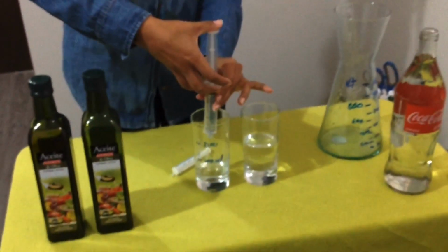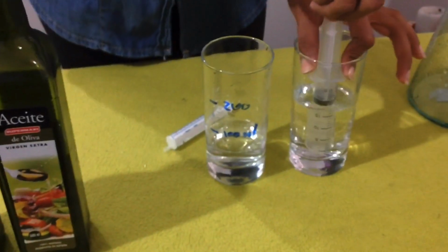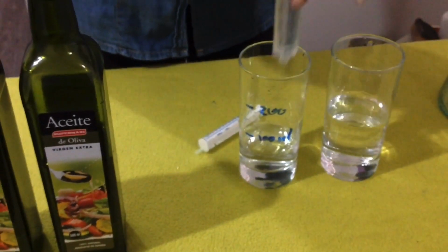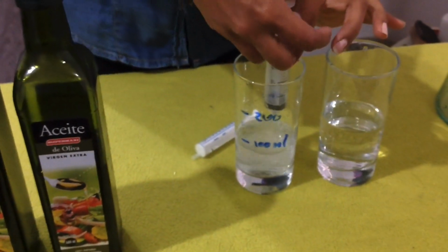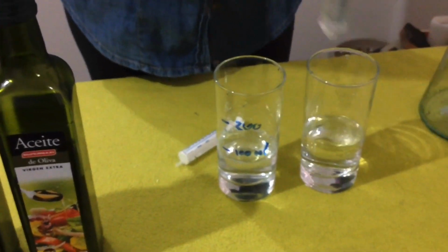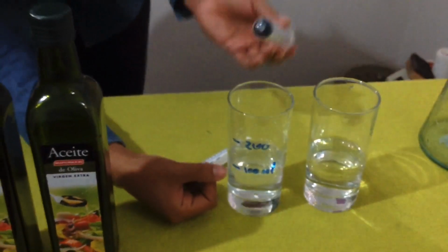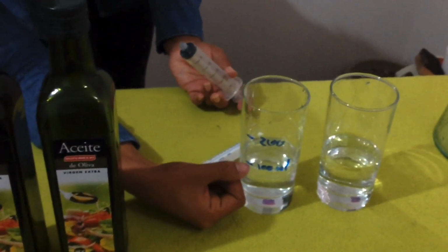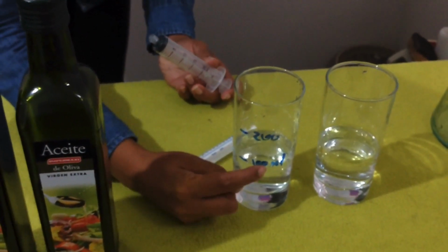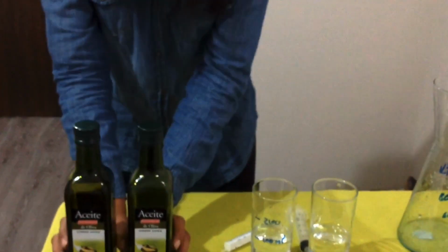That's gonna be 50. I'm gonna do it 4 times. 75. And if I do it 4 times, you're going to see that it's going to reach until the line that says 100 milliliters.